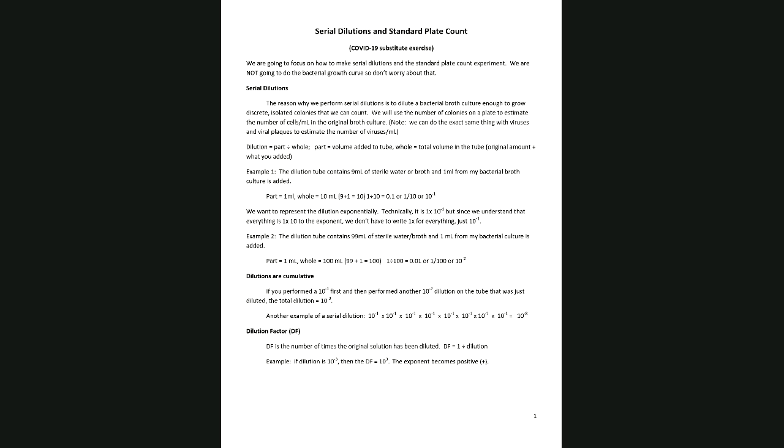So when it comes to a serial dilution, we're going to perform a series of dilutions. And by the end of the process, we'll be diluting our original bacterial sample by tens of millions of times, maybe hundreds of millions of times. So it's a very simple but very powerful technique. It does involve some math, but it's not complicated math.